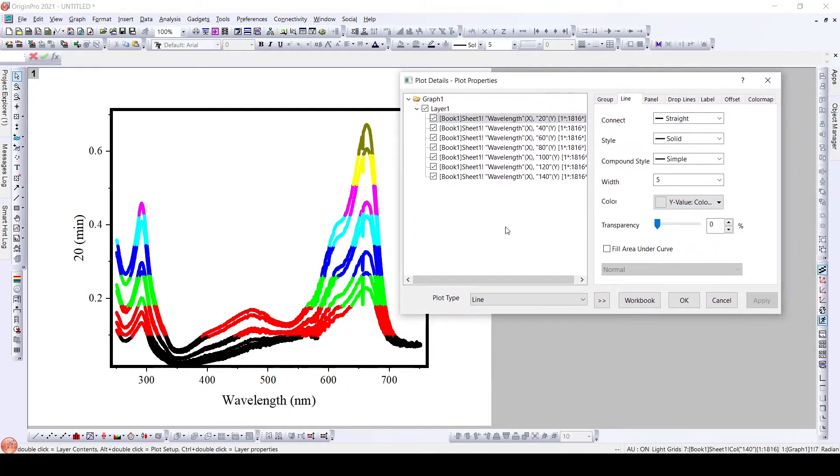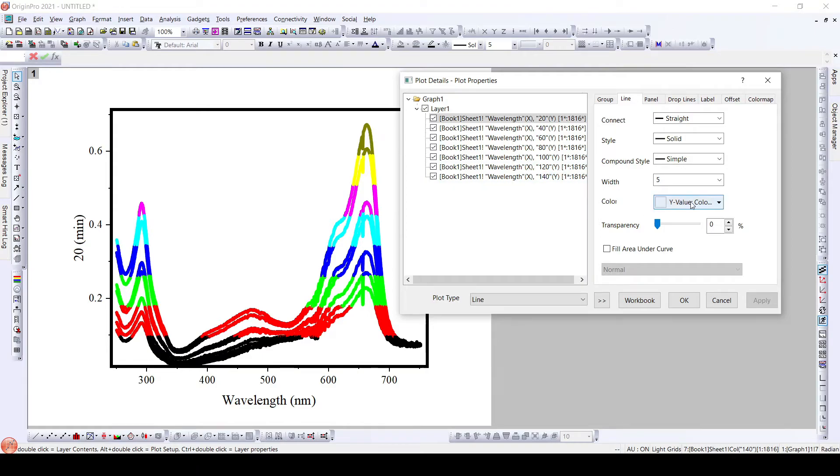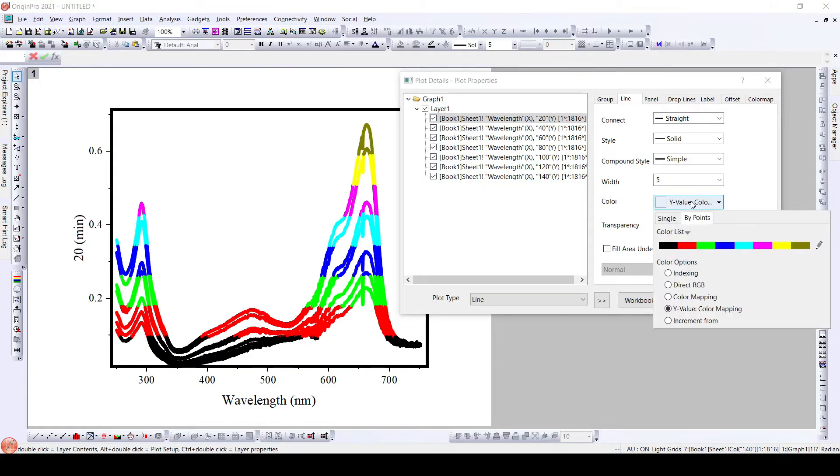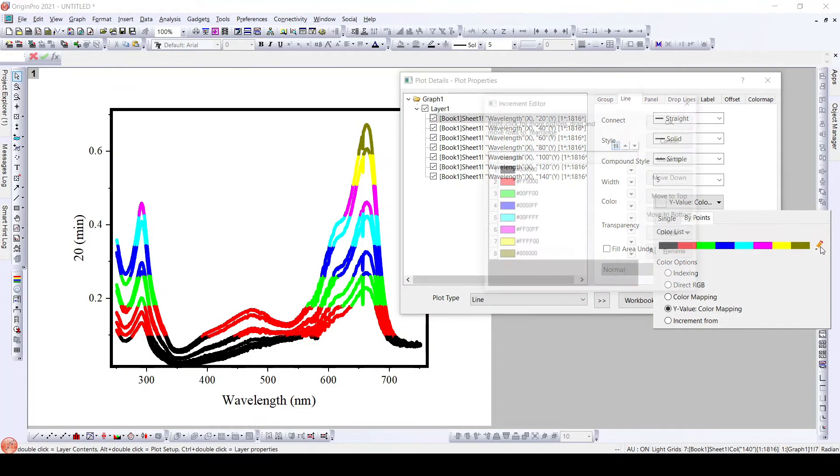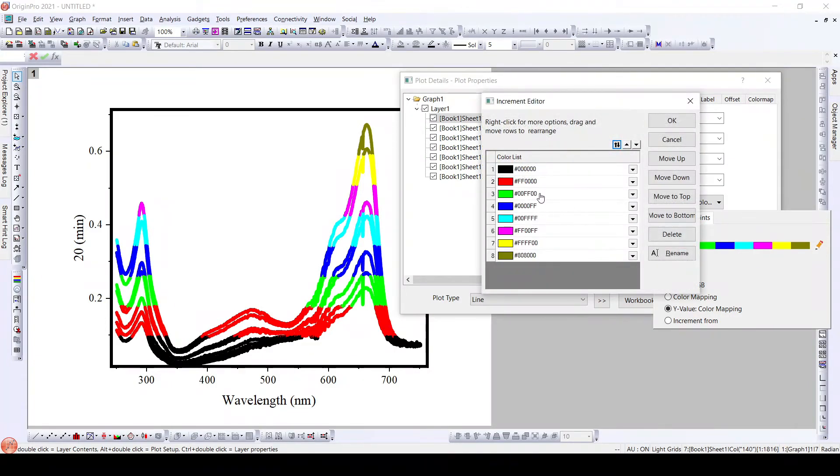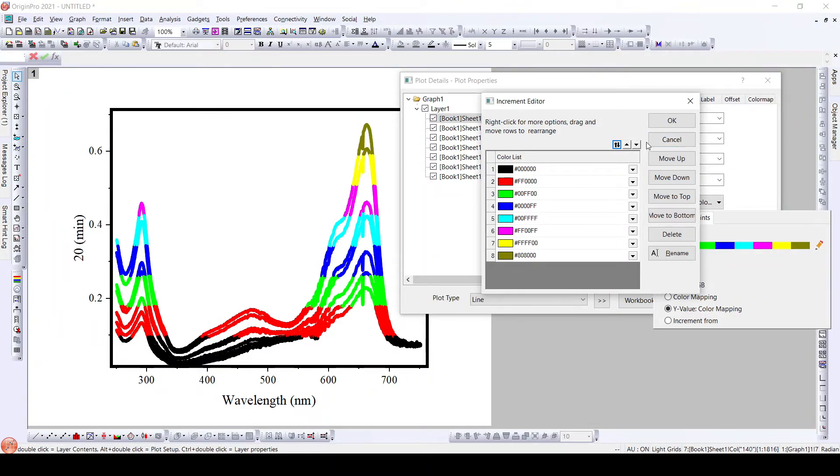With the lowest part with black in color and the highest part with green, green in color. Even what we can do is we can change the color scheme or the colors that are arranged here and based on that we can have different colors. Even we can add some colors or we can change them according to our need.